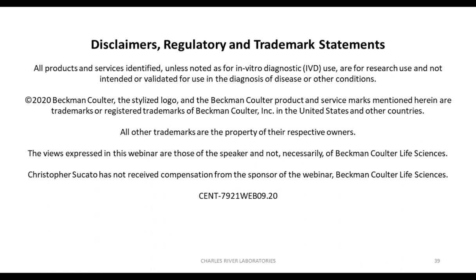Yet, other assays are receiving a lot of attention and a lot of R&D and optimization efforts, including capillary electrophoresis-based methods, including CIEF and isoelectric focusing, as well as ion exchange chromatography.